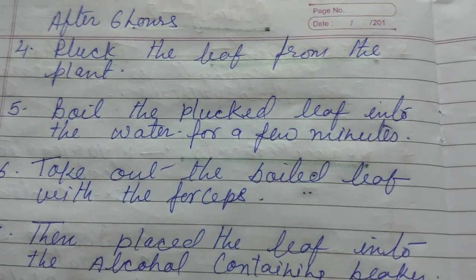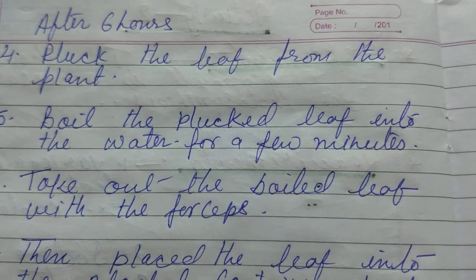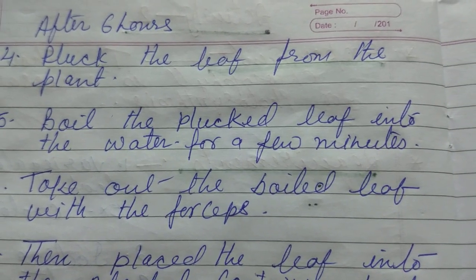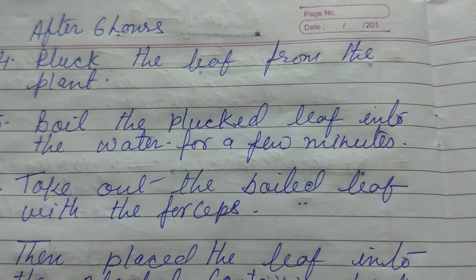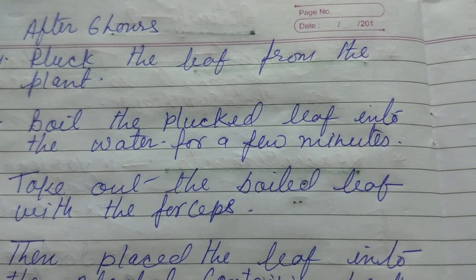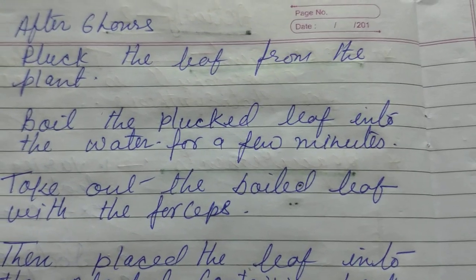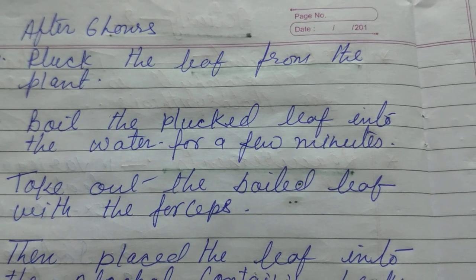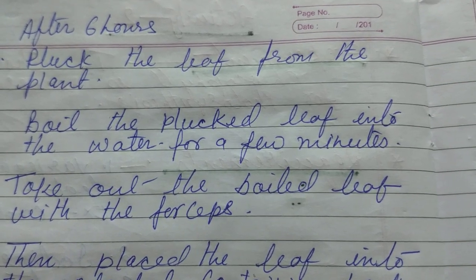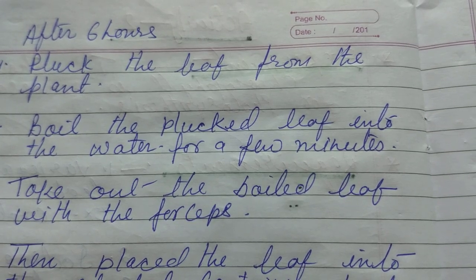Then boil the leaf in water for a few minutes. So we have to take a beaker, pour water into the beaker, put the leaf into the beaker, and keep it on a Bunsen burner. Put the beaker on the Bunsen burner and let the water boil for a few minutes.